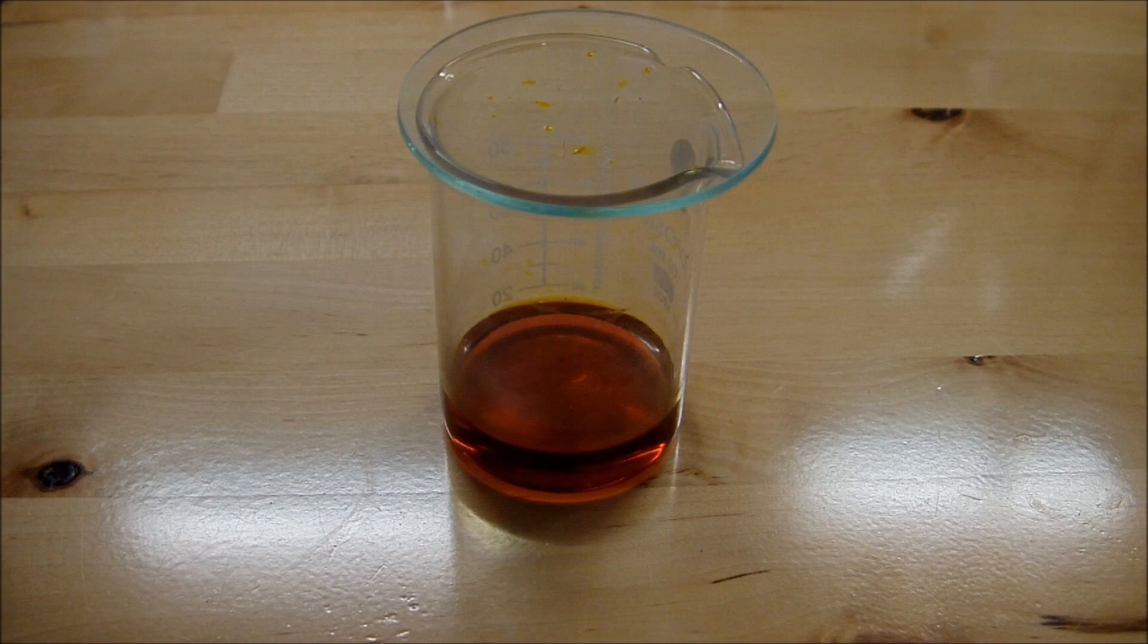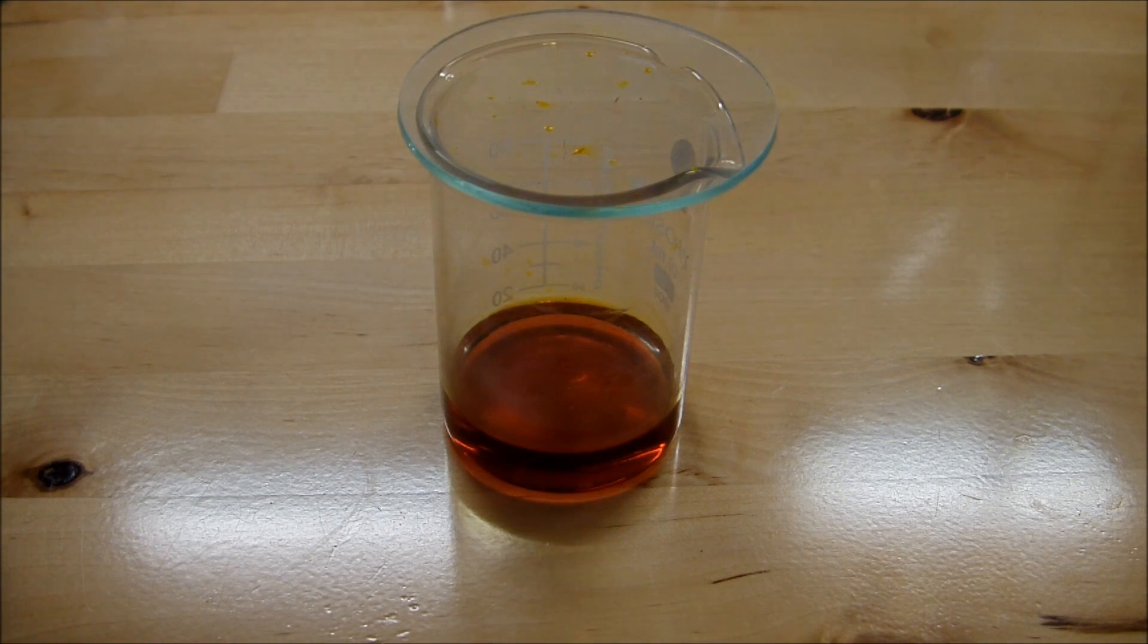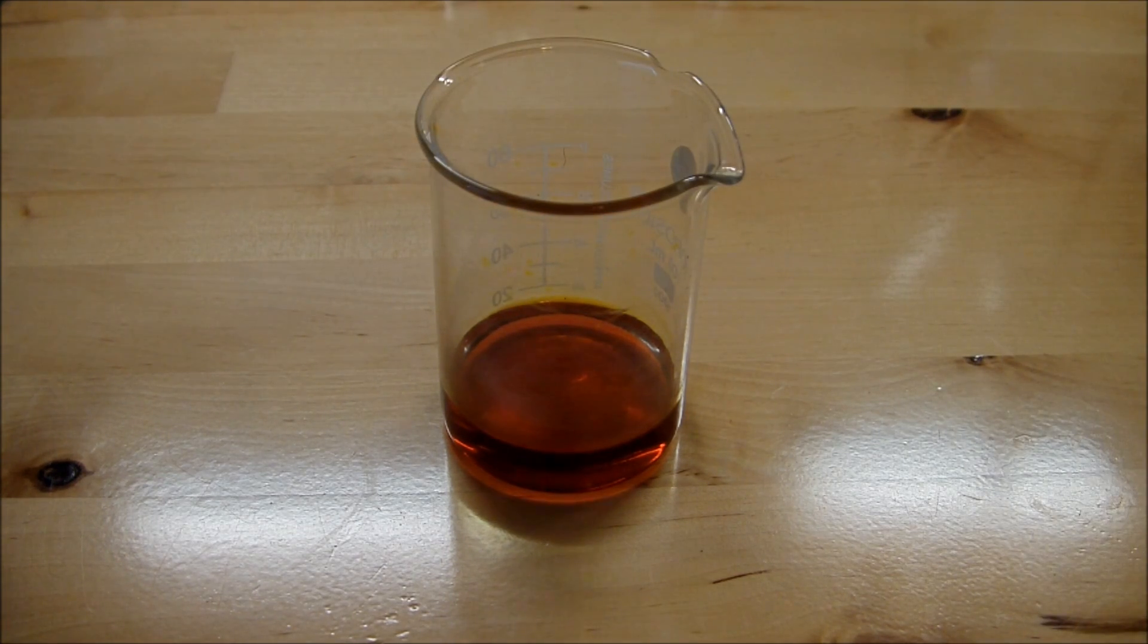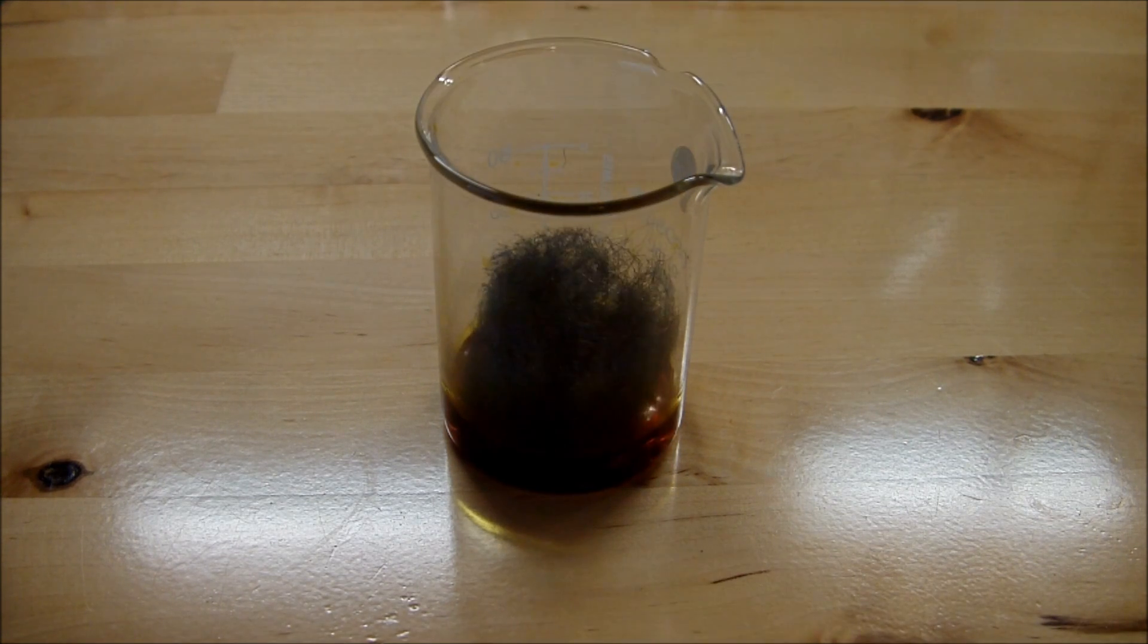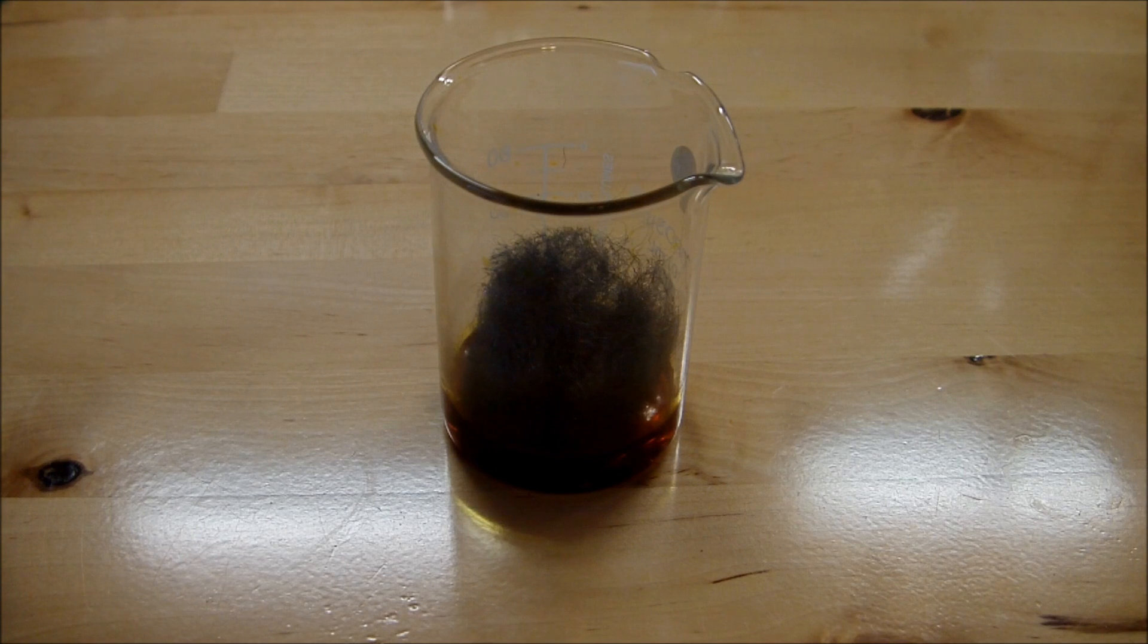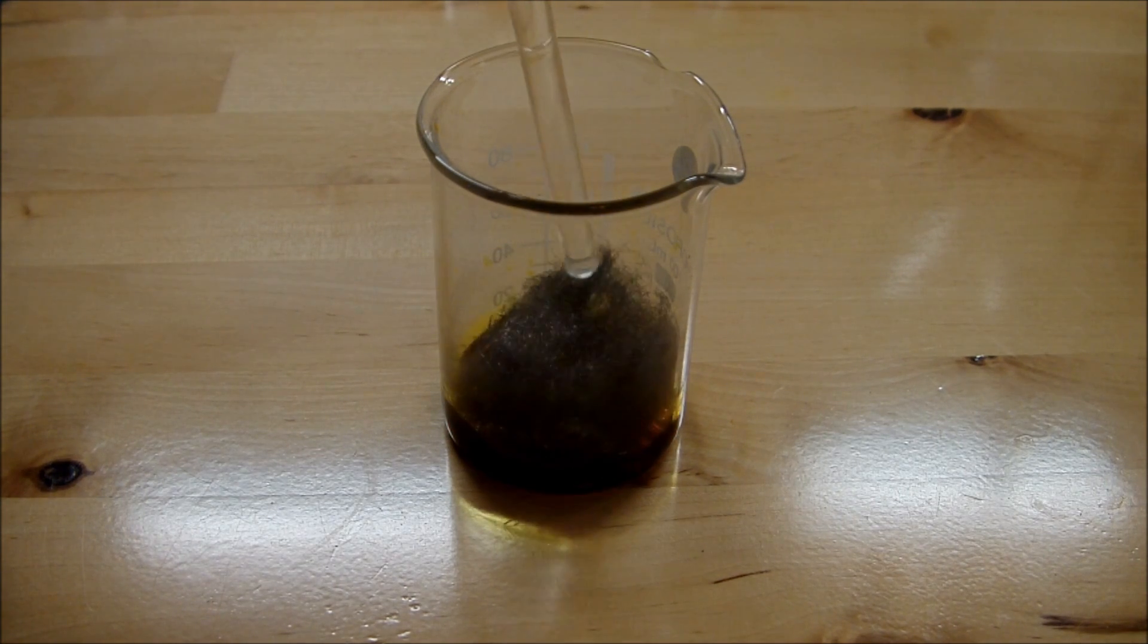Now, if you want to regenerate the iron 2 chloride from the iron 3, you can simply add some more iron wool to it, and that will react to convert it back to the iron 2.